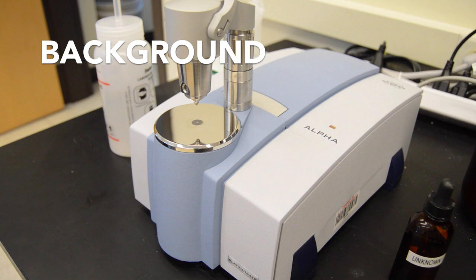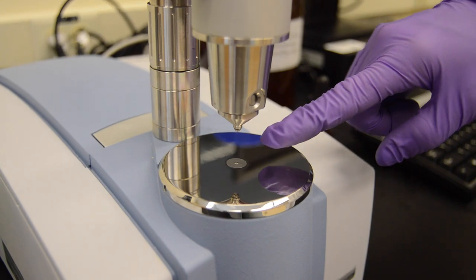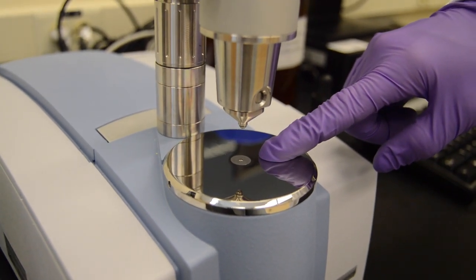Before you can run an IR spectrum, a background must be run. The background takes an IR signature for the molecules present in the atmosphere. Before you run the background scan, make sure there is no liquid or solid on the IR window.